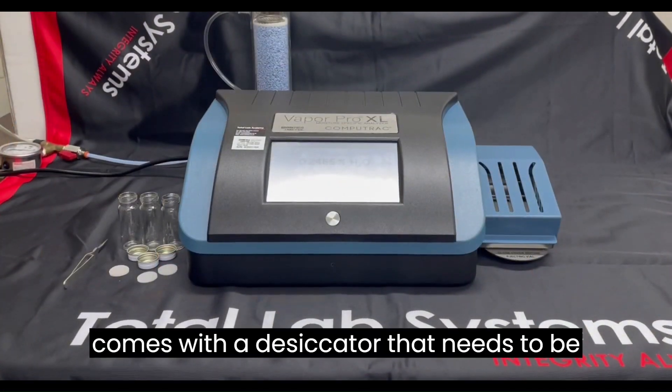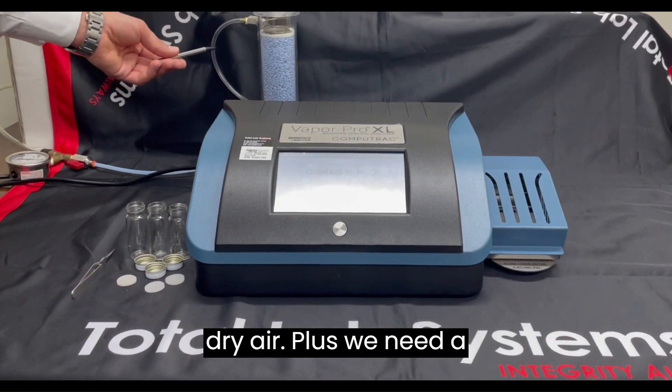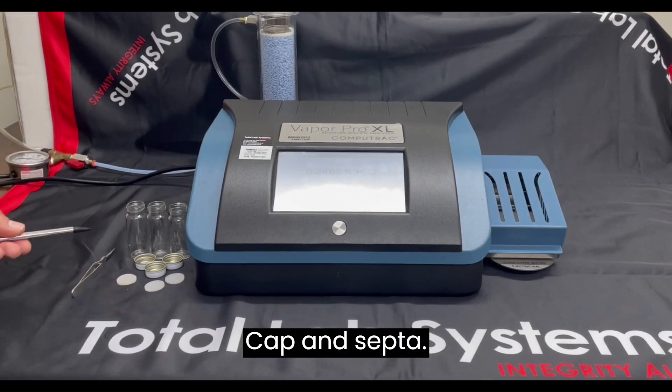The unit comes with a desiccator that needs to be connected to dried nitrogen or dried air. You also need a sample vial to load the samples, along with a cap and sip top.